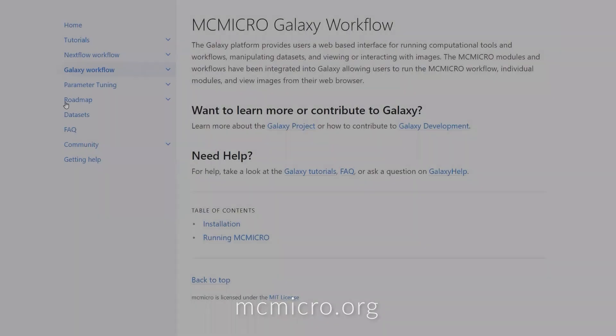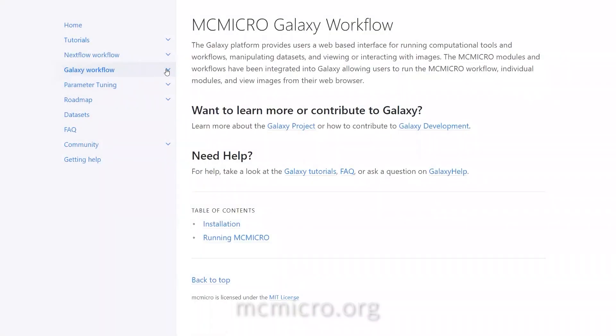MCMicro comes in two flavors. It is command line driven using Nextflow, but also has a web-based interface using Galaxy.